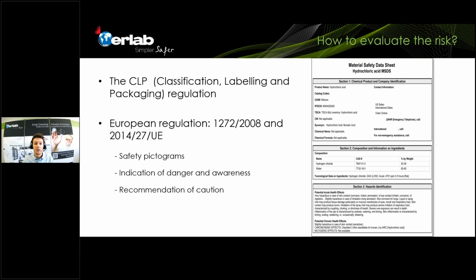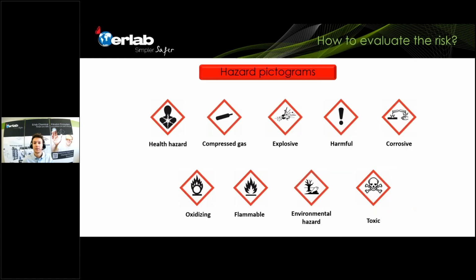So this is also a really good way to know what you need to do, what products you're using, and how you need to store them, etc. Of course, I imagine all of the people connected to the webinar know this. These are pictograms that we see all the time when we work in the laboratory, but sometimes they're forgotten, or they are not really taken into account when you work with products.